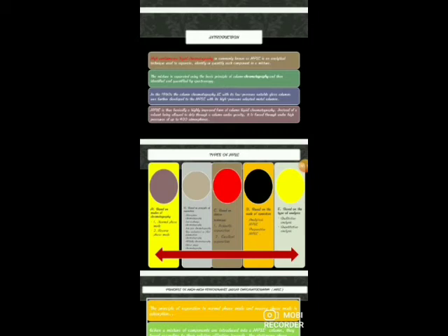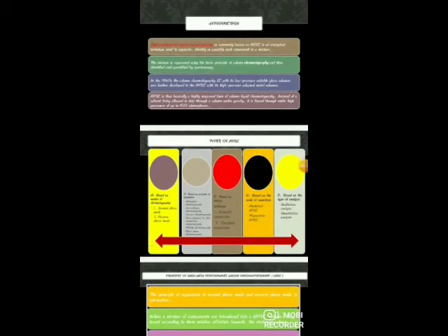Now on the basis of elution technique, there are two types: isocratic separation and gradient separation. Isocratic separation means the same mobile phase combination is used throughout the process of separation, but in gradient separation, a mobile phase combination of lower polarity or elution strength is used, followed by gradually increasing the polarity or elution strength.